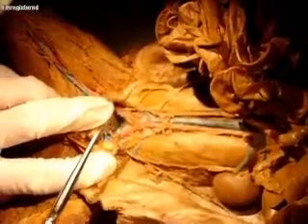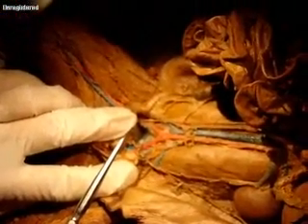I think that's it. I can't find those internal. Esther, you guys didn't have internal iliacs and external iliac veins and arteries?